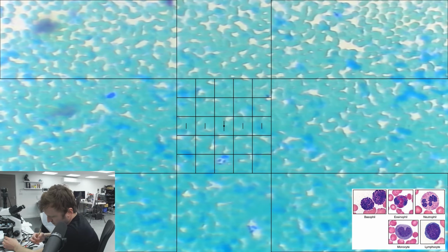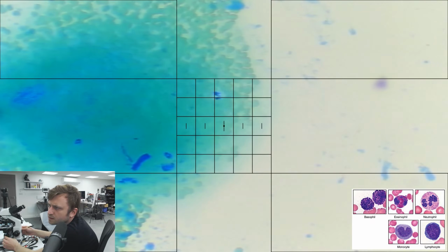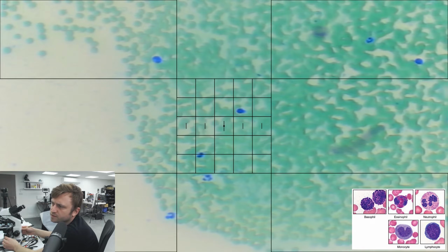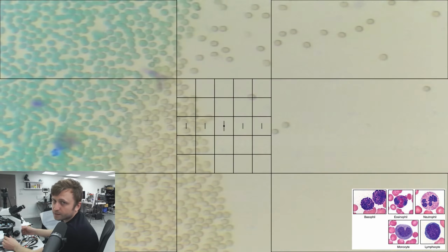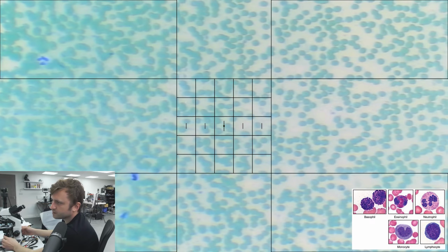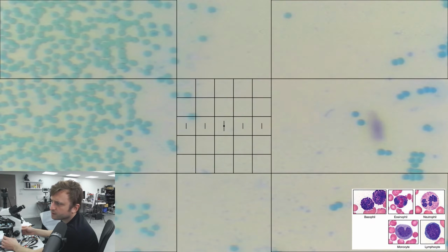Neutrophil below, I think. Random debris. I'm not sure whether to consider that one above. Okay, neutrophil and lymphocyte, I think. Neutrophil and debris shadows. I'm now going to make an executive decision to migrate to a different patch of the stain, so one where I think things are more active. And I'm going to choose a starting point on the edge somewhere.